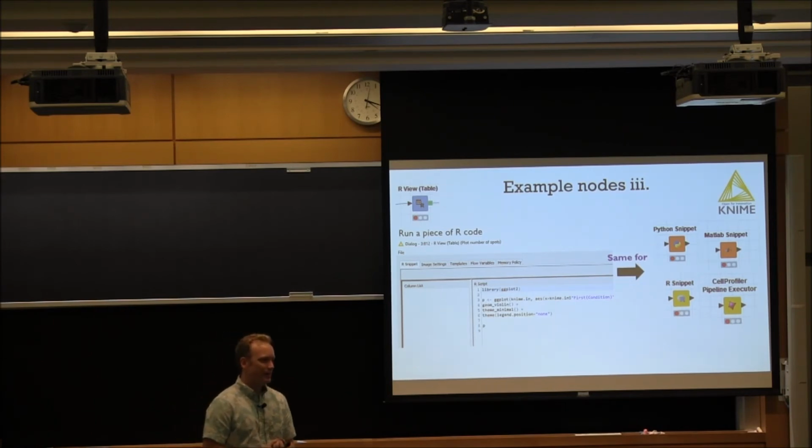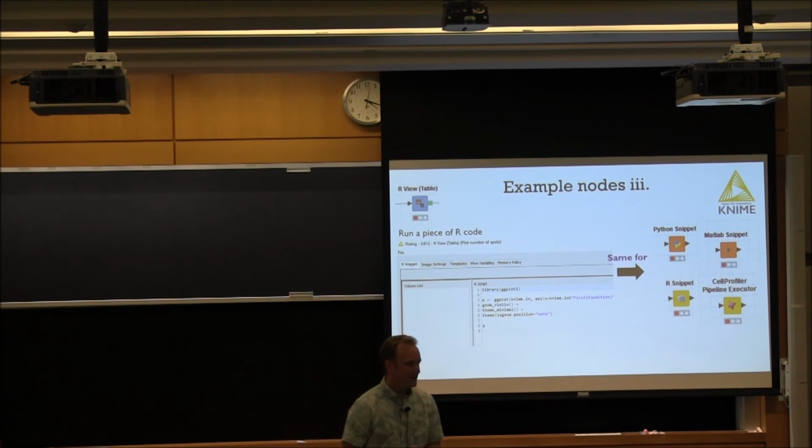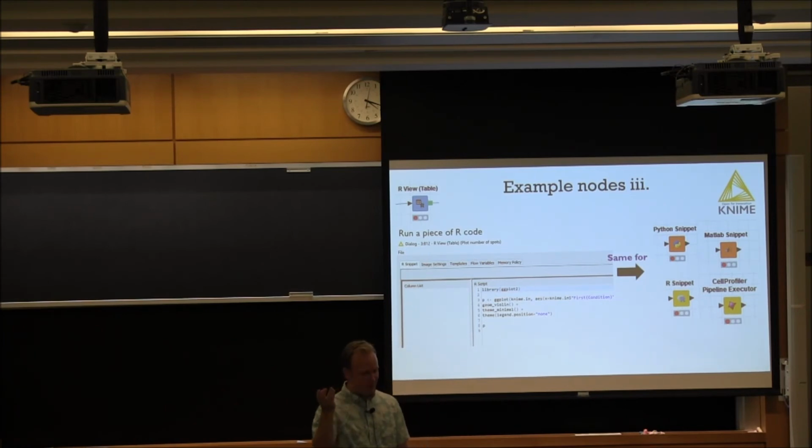Sure. And you showed us several snippets. Yes, like Python, MATLAB, and R. So the development of snippets is open, so sometimes we can develop a snippet into LabVIEW. It's a good question about LabVIEW. I should have looked it up, but there must be some incorporation into LabVIEW as well. I just haven't used it for myself yet. But this would be open, yes.